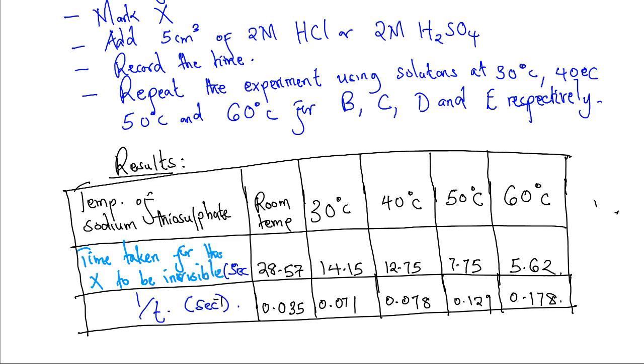Now, this is how the reaction between sodium thiosulfate and hydrochloric acid will show different time recordings, that is at different temperatures.